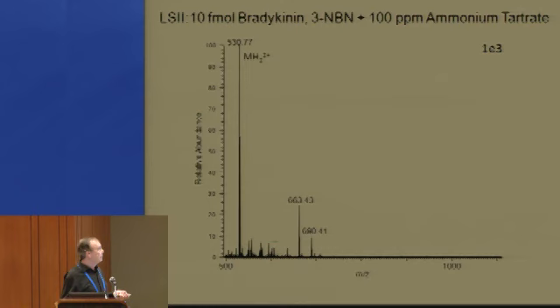Here's an example with a fairly high concentration of insulin in a dirty system — you get lots of adducts and things and it doesn't work well — but if you throw in the ammonium salt, you can really clean it up and get a very nice spectrum. So ammonium salt works with laser spray just as it does with MALDI.